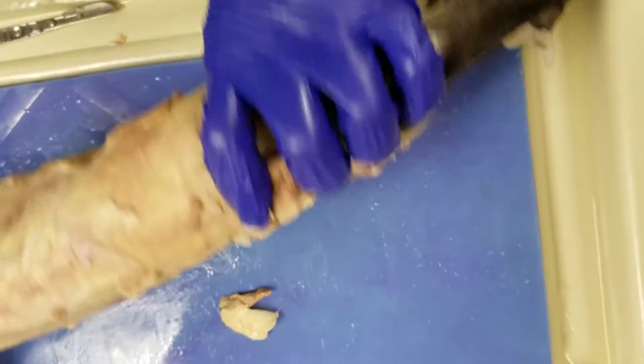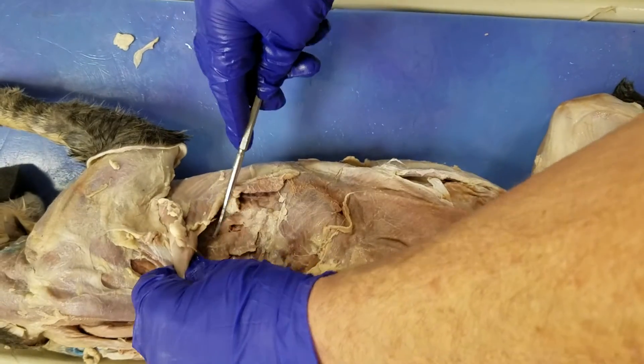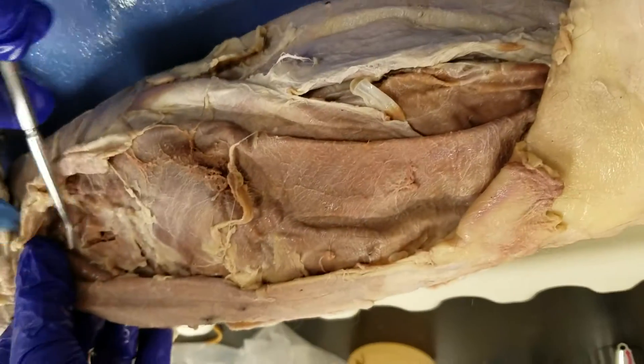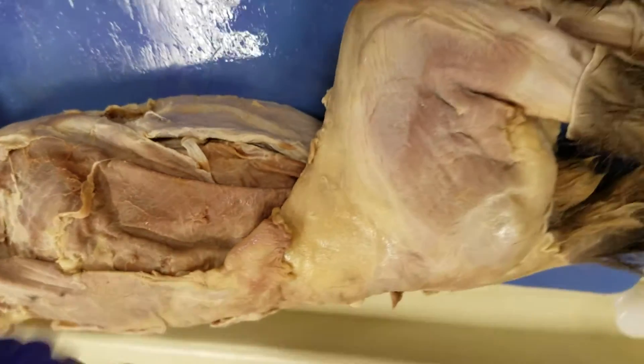Did I get them? Did you do the serratus? Did I do the serratus anterior? No. Serratus anterior — the fan-shaped muscle right there, under the latissimus dorsi toward the front, where the ribs are.